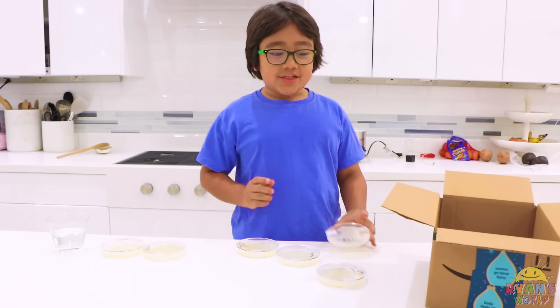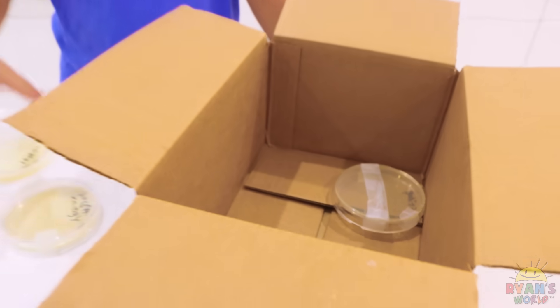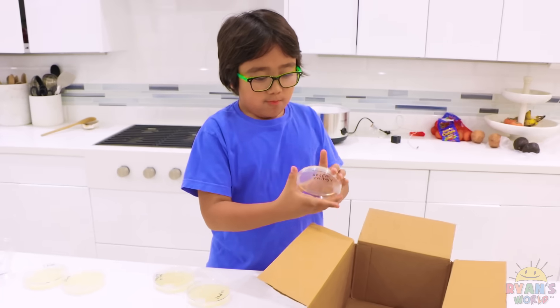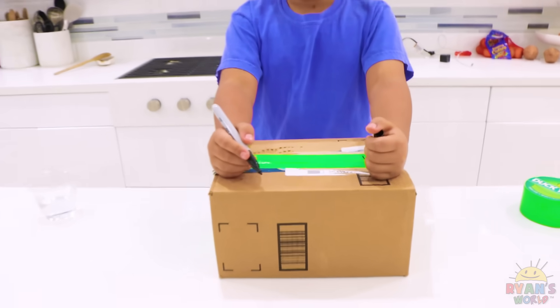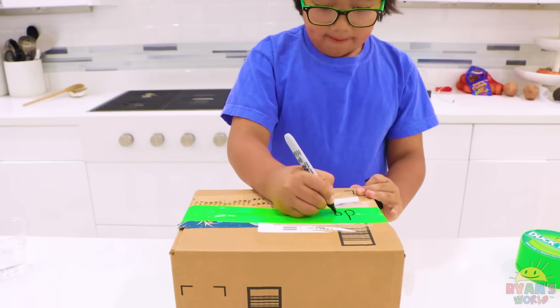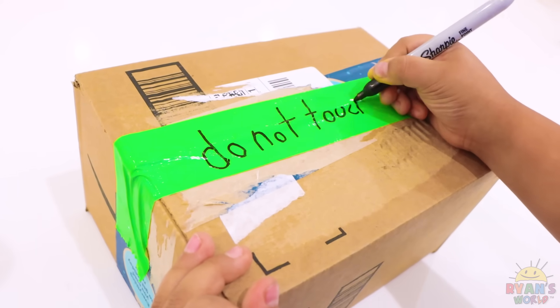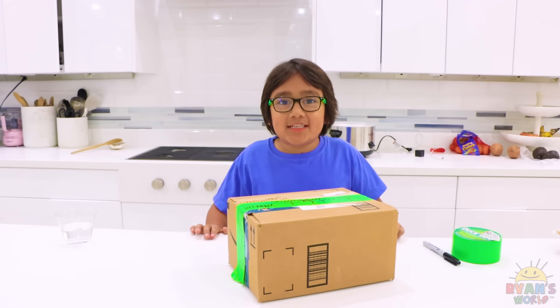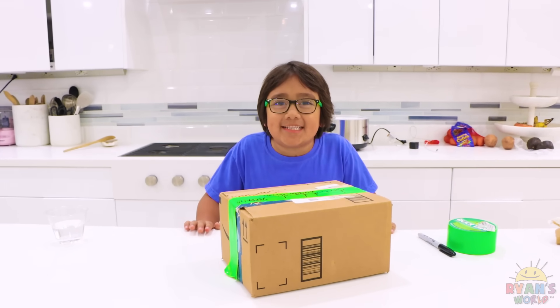Now I'm going to transfer the plates into the box. After I close it, we're going to put a 'do not touch' sign on it. We're going to keep this in a safe place and we're going to check up on it in three days.